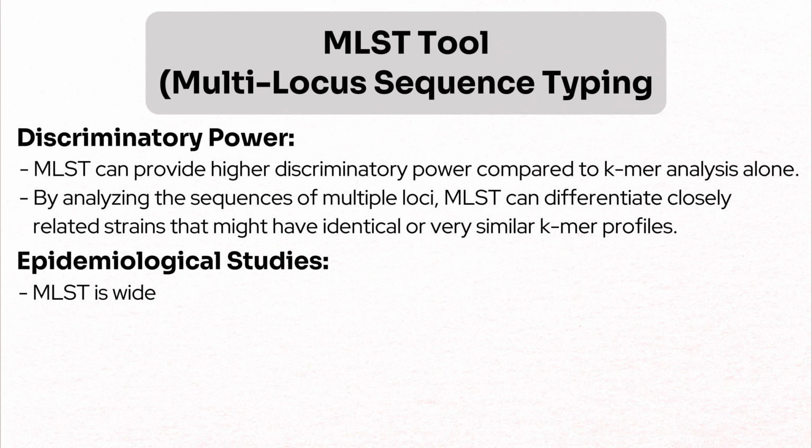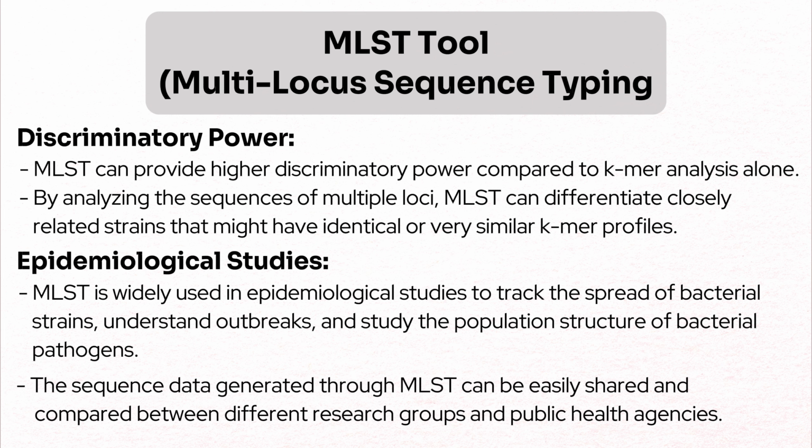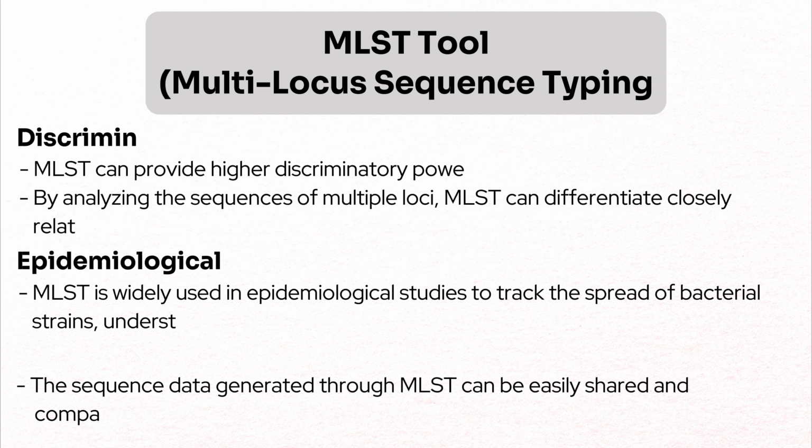Epidemiological studies. MLST is widely used in epidemiological studies to track the spread of bacterial strains, understand outbreaks, and study the population structure of bacterial pathogens. The sequence data generated through MLST can be easily shared and compared between different research groups and public health agencies.